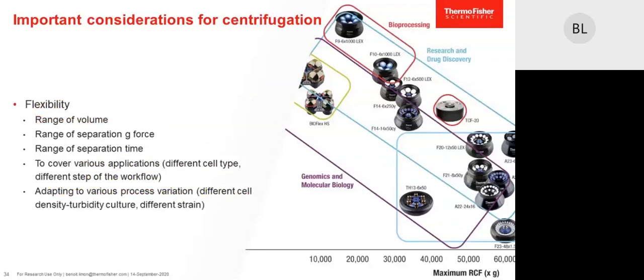So for centrifugation, the flexibility comes with the range of different rotor, different type of machine, and different size of container.